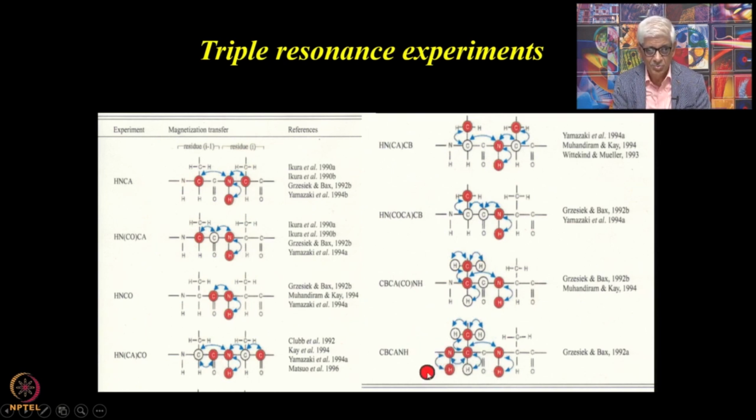So you have this NH proton as well as this NH proton. Once again it goes through the same pathway, from here to here, here to here, and you also can go from C beta to this, then from here you can go here. So these are all out and back pathways, and from here you start from the C alpha and go to this nitrogen as well.